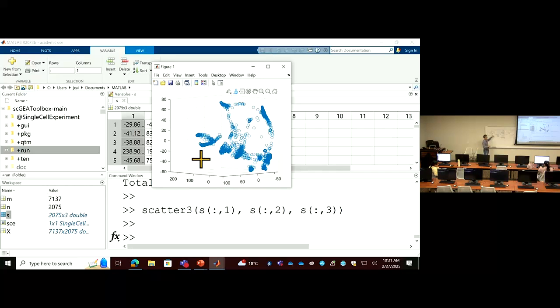If you start from the original data, you'll still be able to work, because you can do k-means using so many parameters to define each cell. But when k-means computes the distance between cells, it will not deal with the distance so nicely as a dimensionality reduction. That algorithm was specifically designed to look at the distance between cells and transform it to make clear groups.